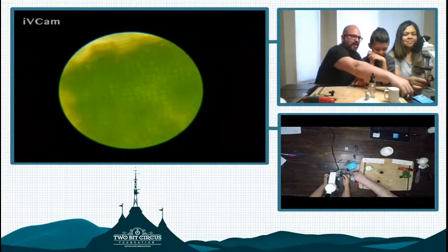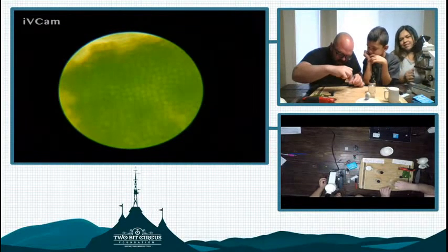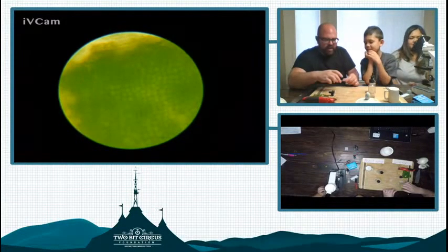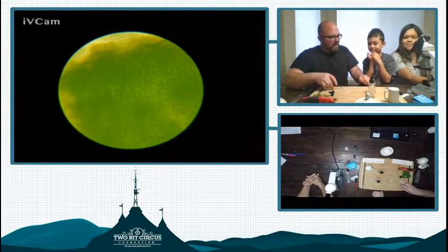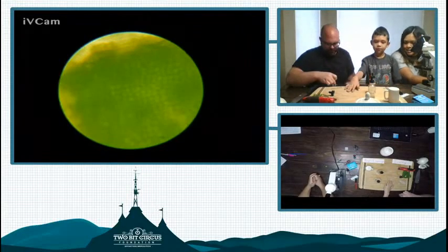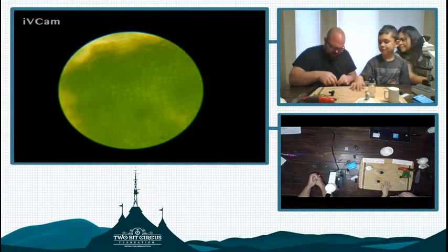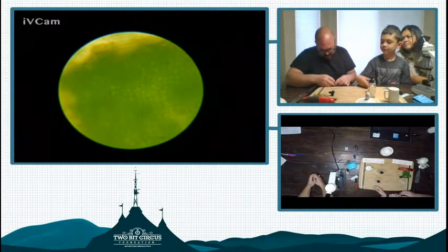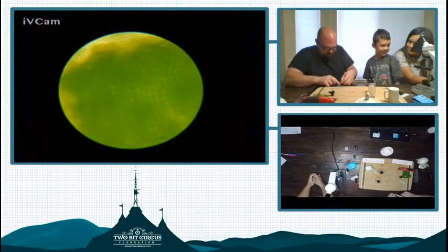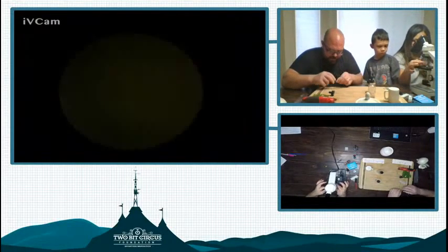I just dumped all the sugar onto the cutting board. So let's move our sugar into the center. Awesome. Hey Malin, should I add water to the sugar, or should I just make a dry slide? You do a dry slide. Now, what's the benefit of adding water to slides like that? You break things apart. It separates things, suspends things.